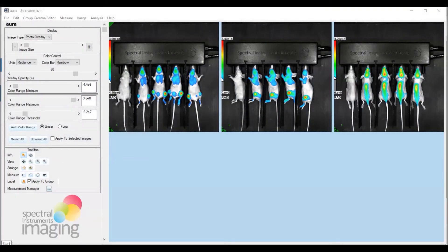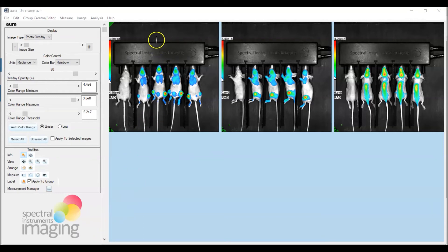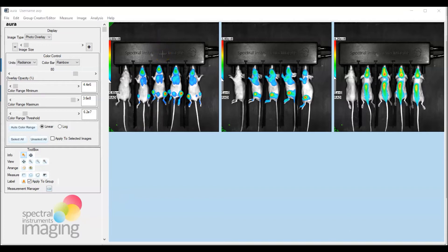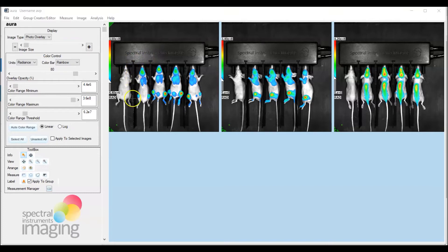All right, so let's begin our analysis of this optical data set. We're going to start off with the image here to the left and we are going, as noted, to draw whole mouse ROIs to quantify the total optical signal detected on a per mouse basis.